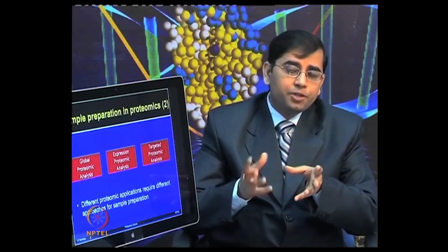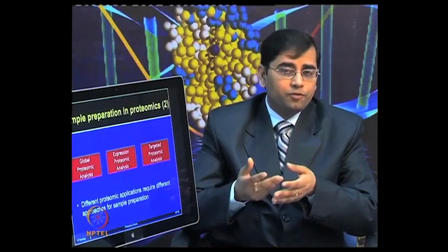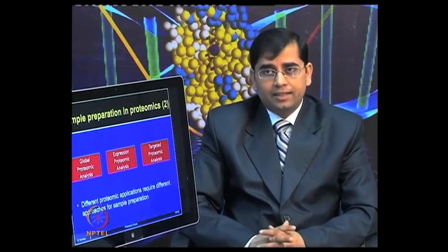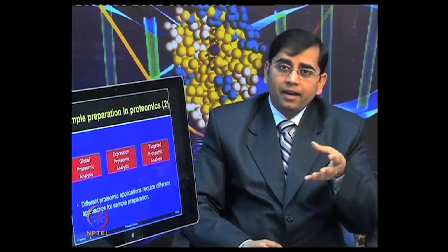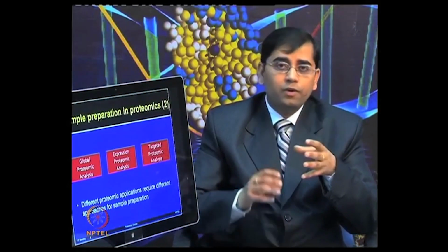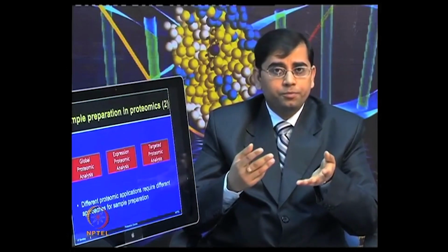So, protein expression analysis is most commonly used for various types of clinical and other studies. Targeted proteomic analysis, if you are very focused on a given organelle or a given sample type, often you would like to know what is happening in that particular proteome, for example, the mitochondrial proteome.